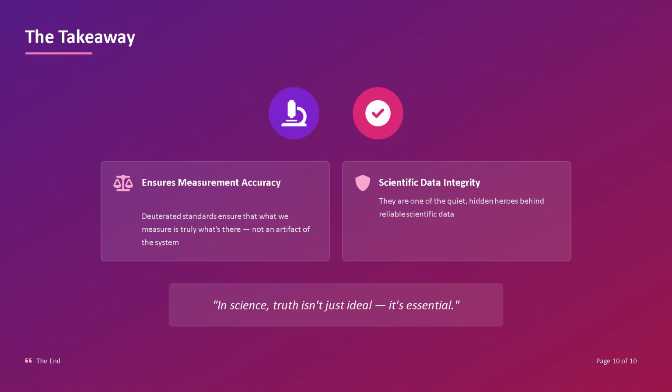Deuterated standards play a quiet but crucial role in ensuring accuracy in LC-MS analysis. They allow us to confidently say that the numbers we report reflect reality, not instrument variability. And in science, accuracy isn't just helpful, it's foundational.